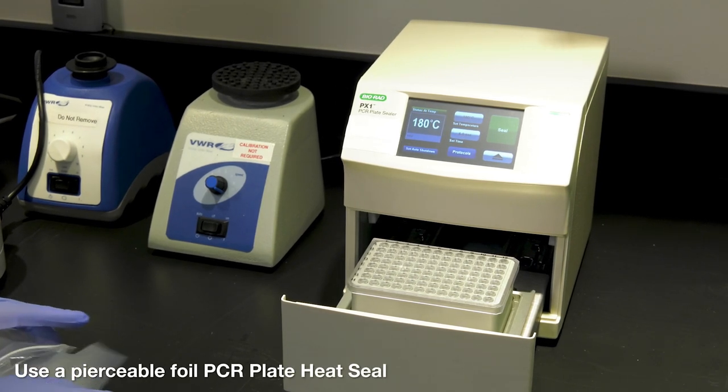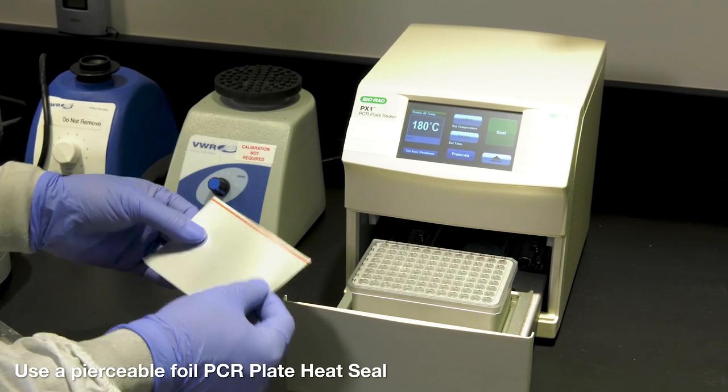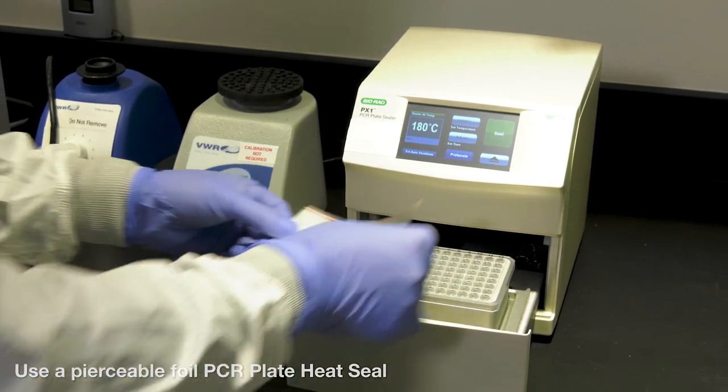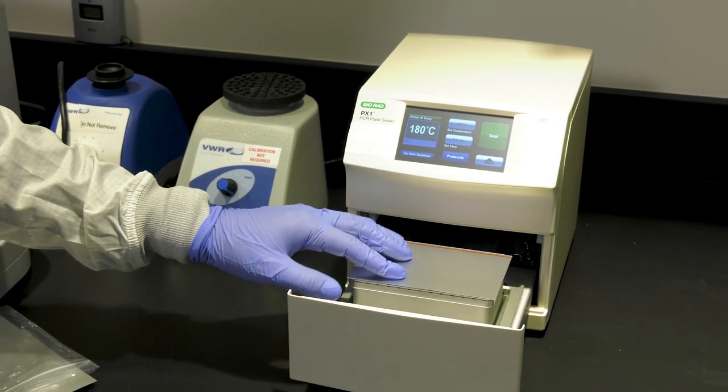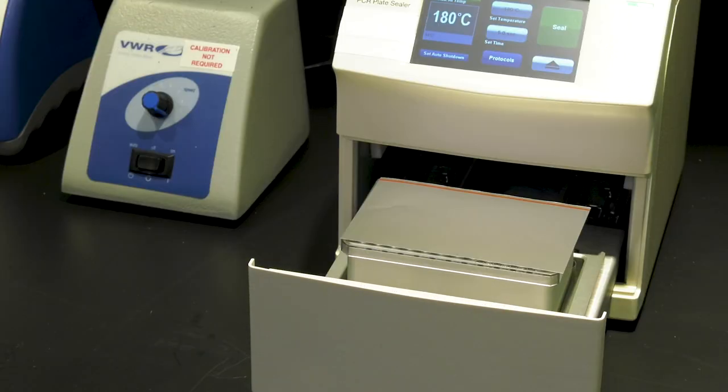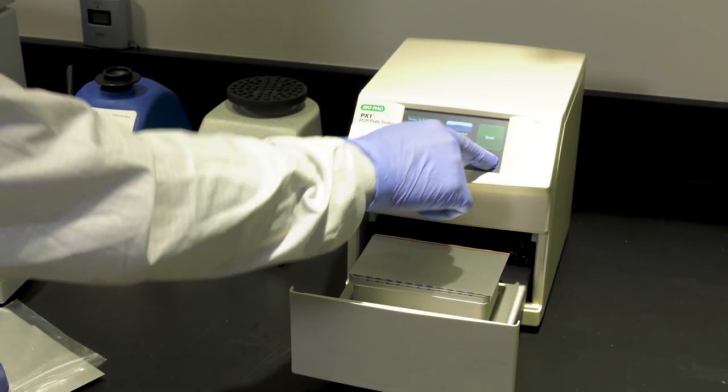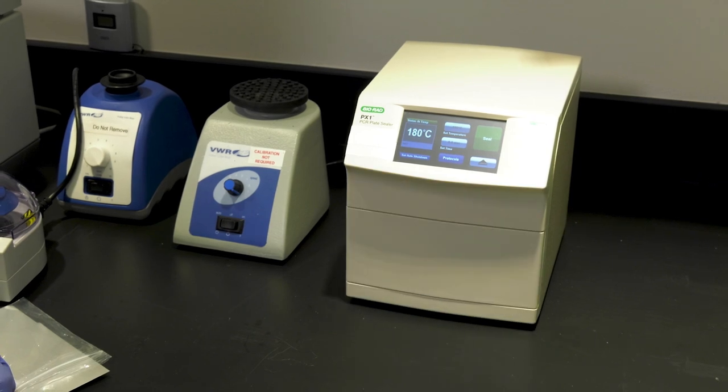Take a single, pierceable foil PCR plate heat seal, making sure you have just one seal. Place it on the DD-PCR plate with the red stripe at the top facing up. Make sure the seal is nice and square and seated well on the plate. Close the PX1 and press the seal button one time.